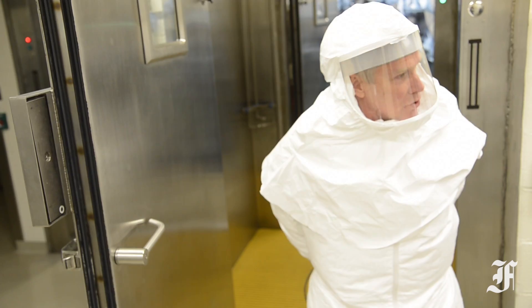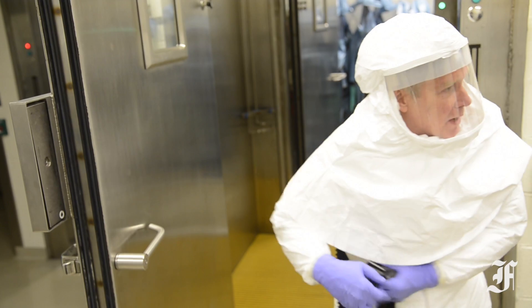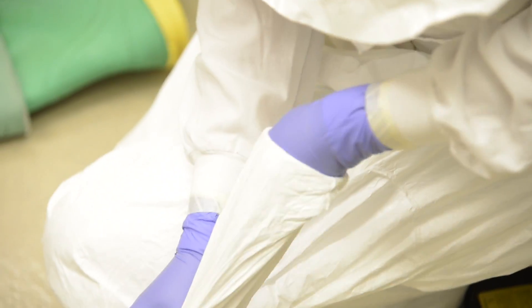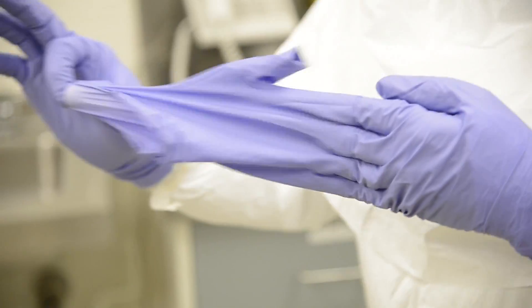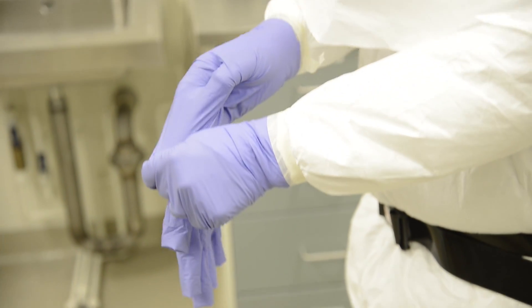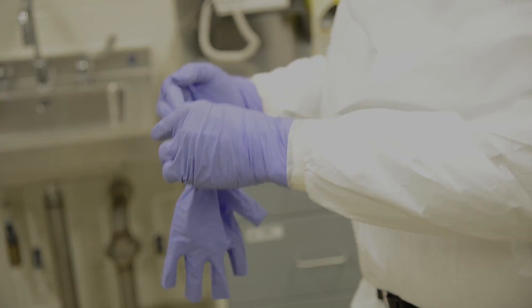And at each stage of removing those myriad layers of protection, a bleach solution is always on hand in a spray bottle, used to disinfect equipment and abate any vulnerabilities that arise when removing the PPEs. It's a slow, deliberate process, one that can come after eight or more hours of sweating inside the suit while handling dozens of samples of deadly virus.